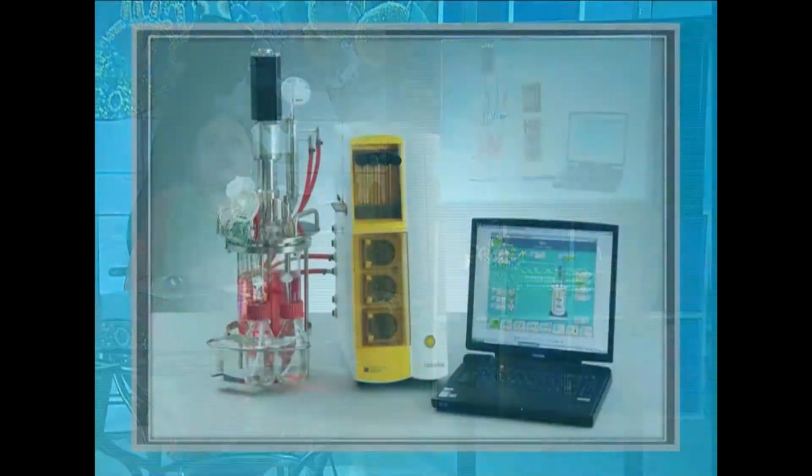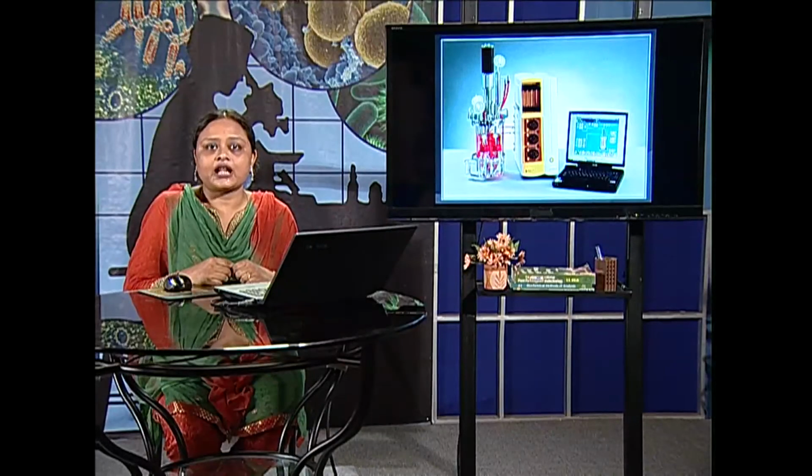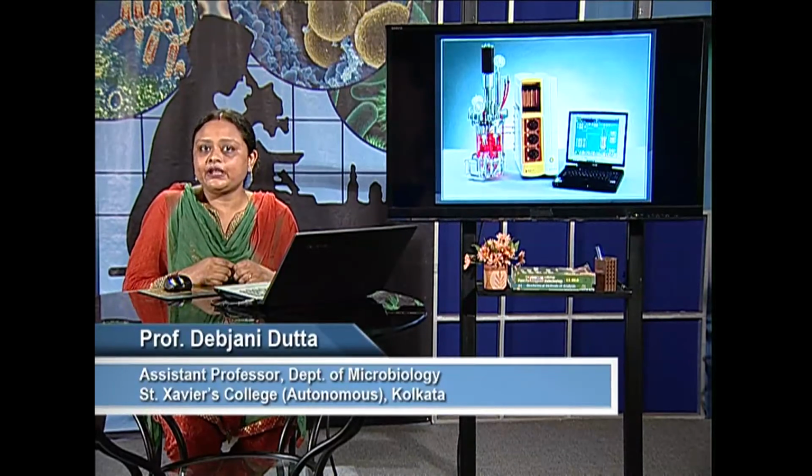So we have seen a whole lot of equipment which can be used in a bioreactor system for the proper maintenance of ambient conditions required for growth and productivity brought about by a microorganism. With this kind of idea, we will briefly have to see exactly how an industry should have all these, and they should also think about containments like going for the GILSP, or good industrial large scale practices, which means these must be maintained so that the organisms are not released into the environment, do not cause any ethical problems or any personal damage, and equally well, we have a sound and good amount of yield from a product.